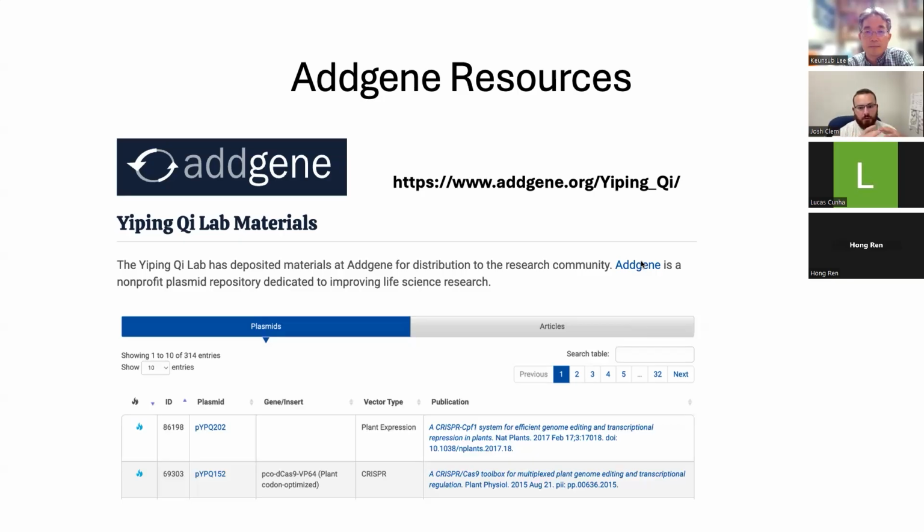We use a platform called HiTOM, which stands for High Throughput Tracking of Mutations, and that allows us to efficiently and relatively cheaply look at the genome editing outcomes. But we do it all through a PCR and sequencing strategy, to answer your question. So for that particular example, for 16 guides, we amplified all of those sites for each plant.